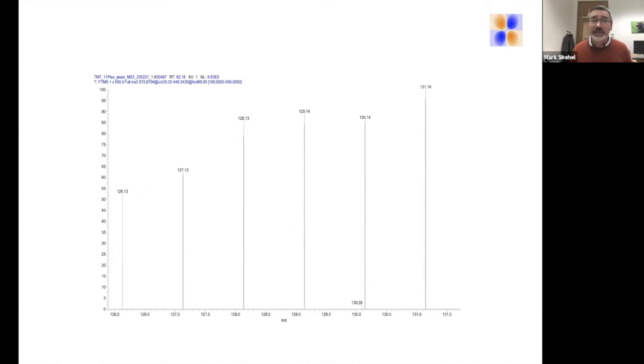isolating peptides. Okay, so whereas before on some of our Q-Exactive instruments you might have seen a change in expression of maybe 2:1, 3:1, here you'll see a more true value. You might have seen 2:1, but actually the true value was more like 8:1. So we should get a more accurate value.